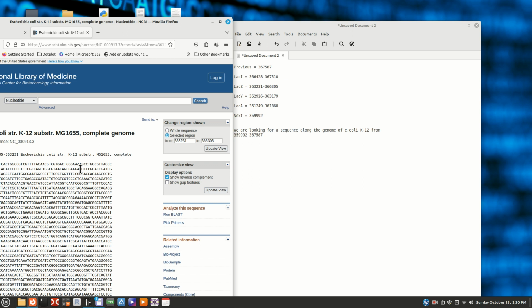You just got to move the numbers around and check. You might have to go check the sequences and see where they line up. Hopefully they tell you the same like they did here. This is simply a well-used one, the LAC-Operon, so things are checked and updated regularly, but you may not have yours line up as easily as mine lined up here. So check that.